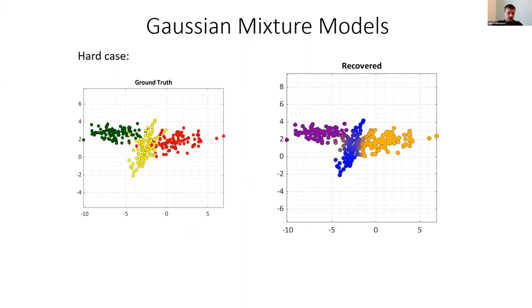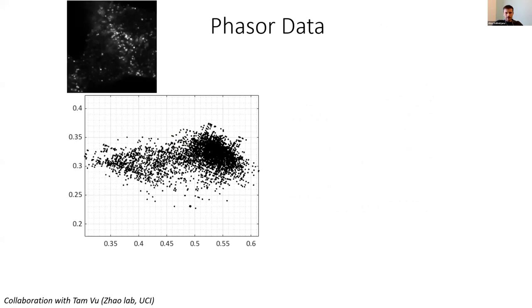This is one of the nice things about this method, that for each point, you get a probability of belonging to each of the clusters. So clearly the 2 points on the far right have 100% probability of belonging to the yellow cluster and 0 to the other two. But for some of the points in the regions in between, you get some proportion of values, which allows you to maybe threshold them out if you want to be very strict with your data, or at least you have the knowledge that you are in a bit of an unknown or dodgy space.